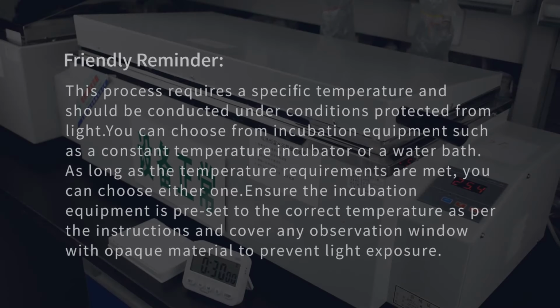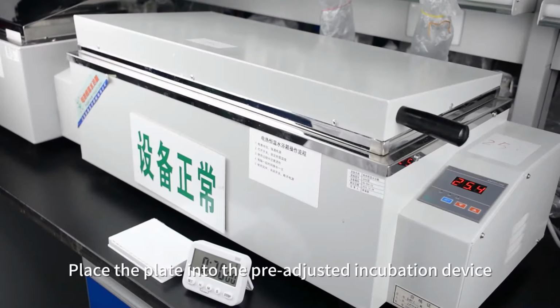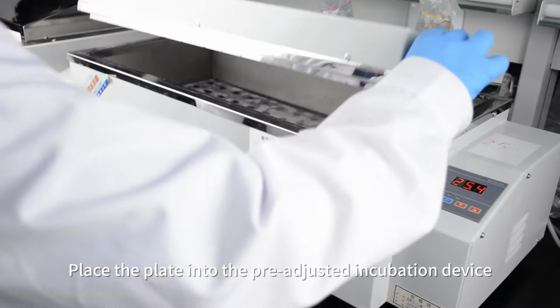Incubation. This process requires a specific temperature and should be conducted under conditions protected from light. You can choose from incubation equipment such as a constant temperature incubator or a water bath. As long as the temperature requirements are met, you can choose either one. Ensure the incubation equipment is preset to the correct temperature as per the instructions, and cover any observation window with opaque material to prevent light exposure. Place the plate into the pre-adjusted incubation device.